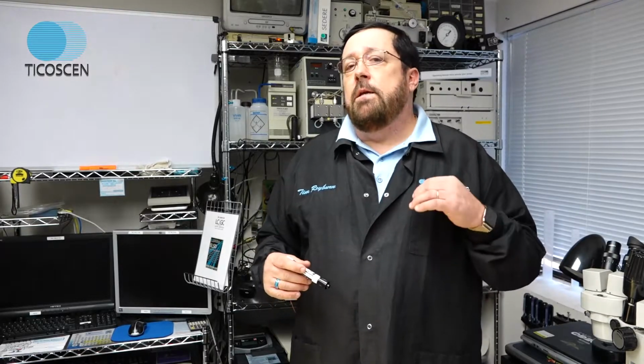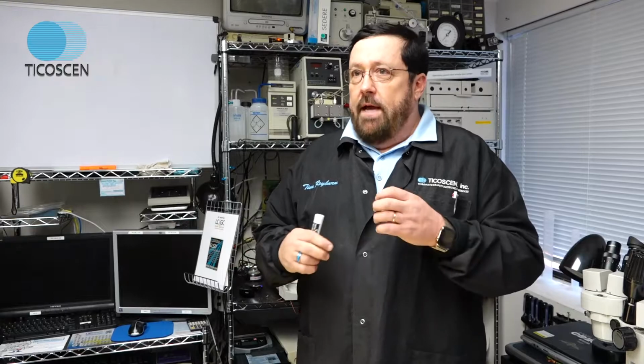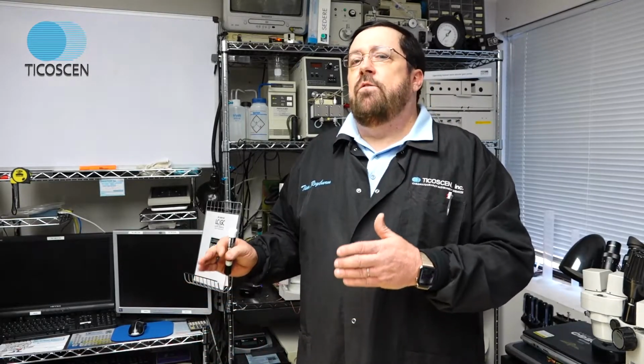And then over time, depending on the concentrations of injections that you're running, if you're running high concentrations of sample, like mgs per mil instead of 250 ppm or 5 ppm, very low concentrations, but you're running milligrams per mil, or you're running this detector at gain 4, that's going to tell me you're running really high concentrations of sample, which means the nebulizer is going to clog quicker and get bunged up, and you're going to have to do a partial submersion sonication of your nebulizer. So that's a source of contamination, pretty common, especially when you're running in the much higher ppm levels of samples. Low concentration folks don't usually have as frequent of performance problems as people running very high concentrations.